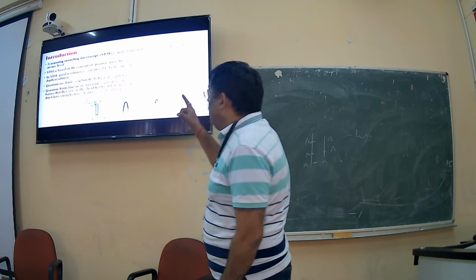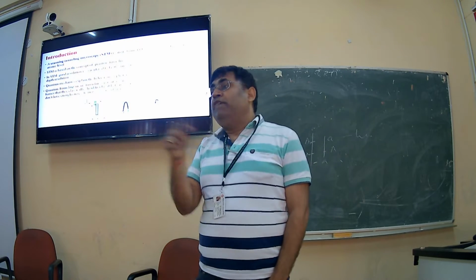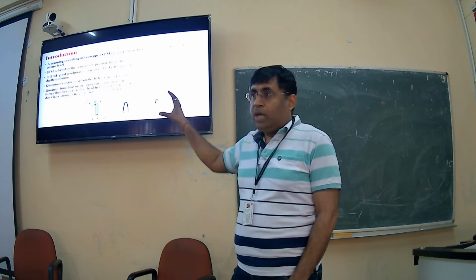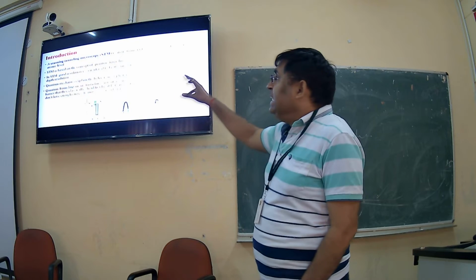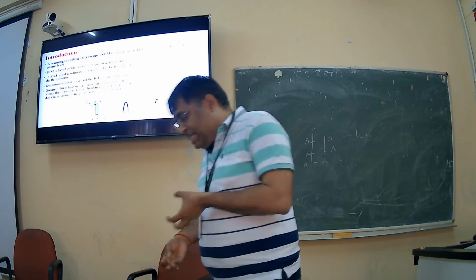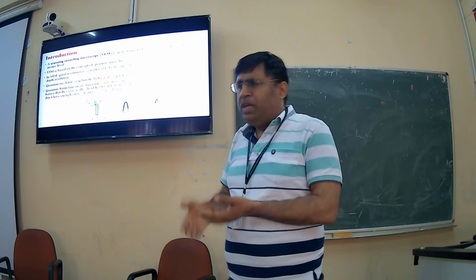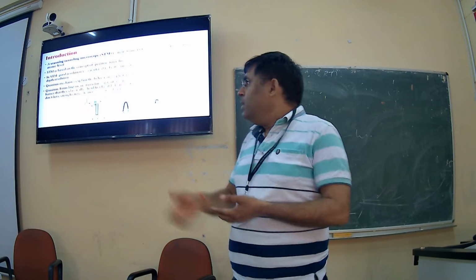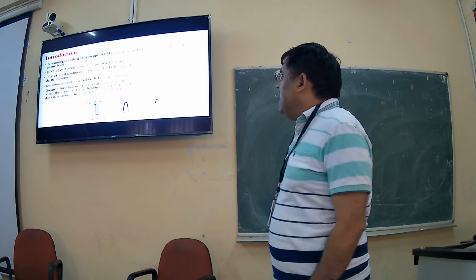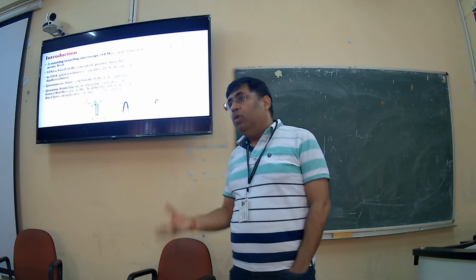So that's why this microscope, using quantum mechanics and the electron wave phenomenon, is using that methodology. That's why it is called a scanning tunneling microscope, where the electron goes through the tunnel using an easy amount of energy. A scanning tunneling microscope is an instrument to image surfaces at the atomic level. Okay, so it will image the surface at the atomic level, which is a very low level.